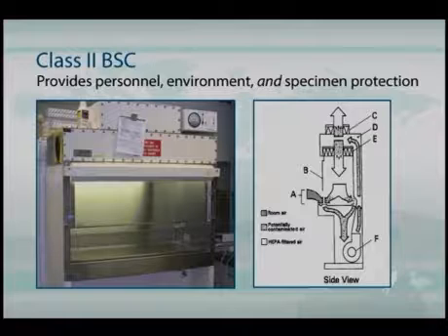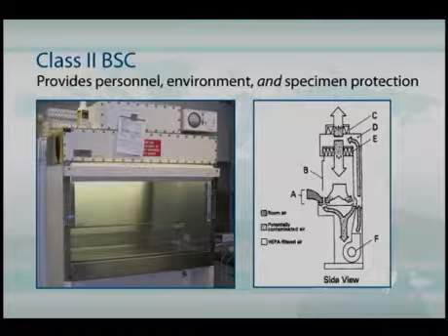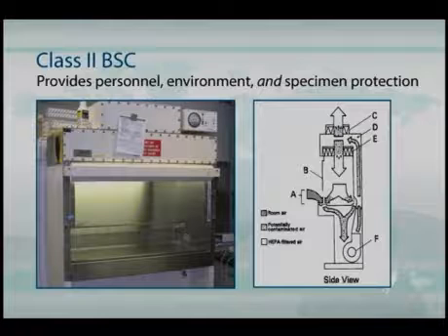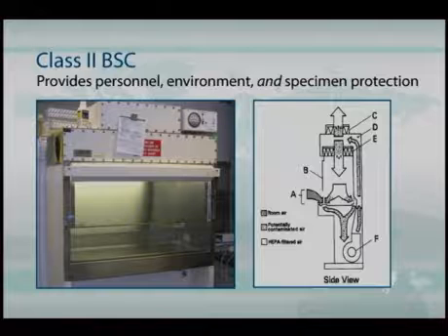The air flowing over the samples in the cabinet is filtered through a HEPA filter above the cabinet, which the airflow then moves down and through the grates to a fan below the working surface, which goes up through a plenum in the back of the unit and then again is recirculated.